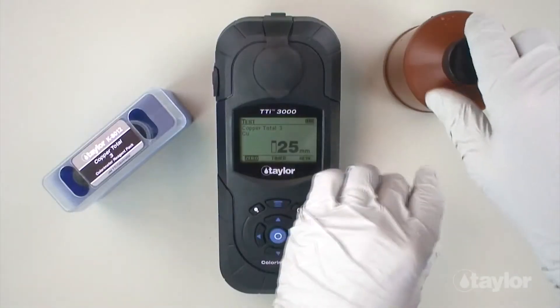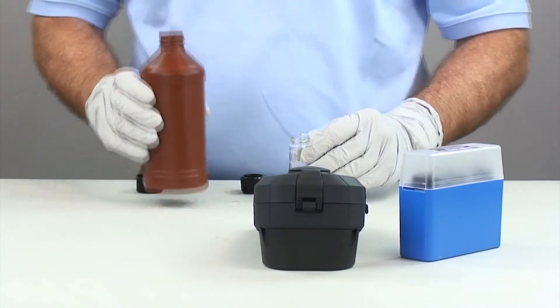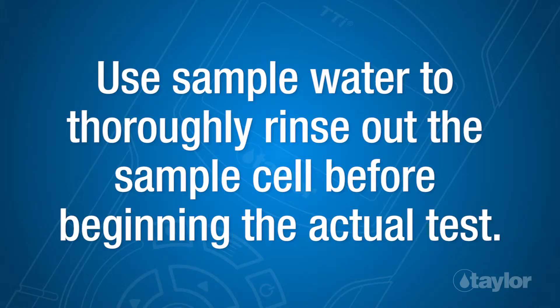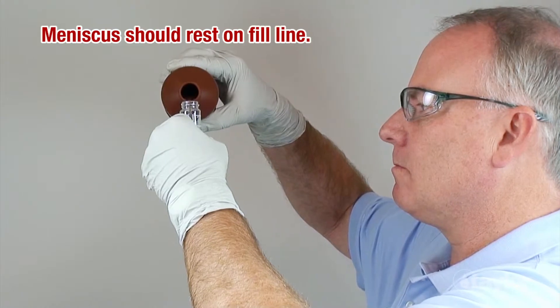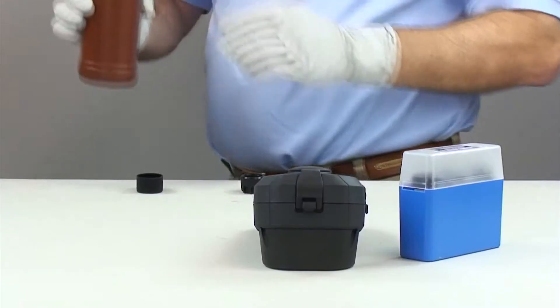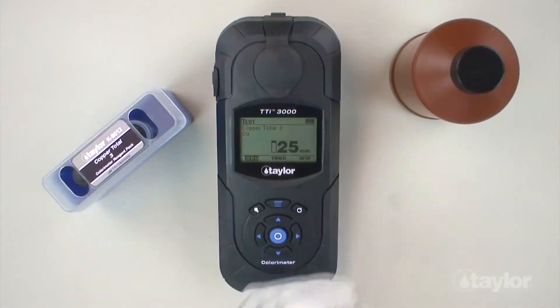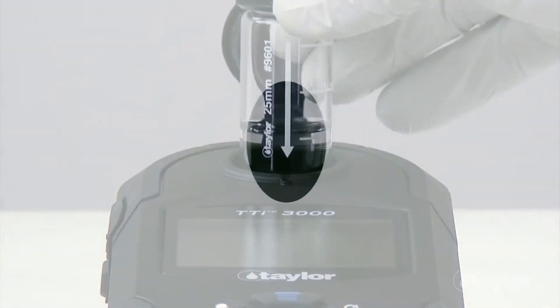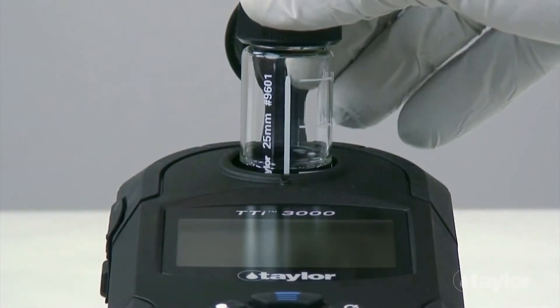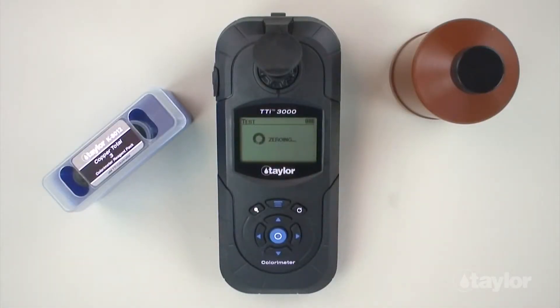Rinse and fill the 25mm sample cell to the 10ml mark with the sample. Then cap it. Insert the sample cell into the sample cell compartment, aligning the arrow on the cell with the notch on the sample cell compartment, then gently push down. Select Zero using the scroll arrows, then press Enter. Zero will be displayed on the screen.